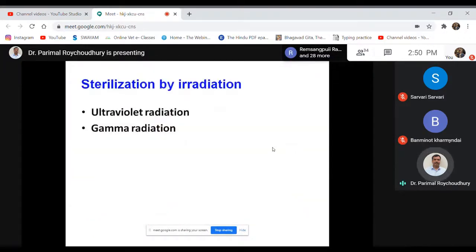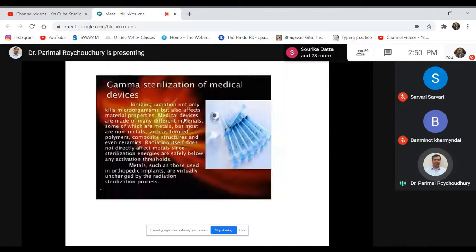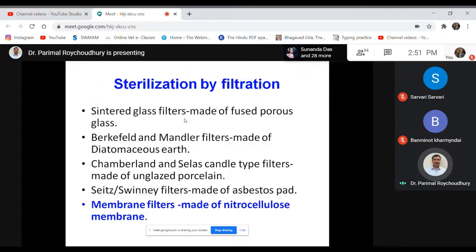Whereas ultraviolet and gamma radiation can destroy all surface components of biological material. Ultraviolet radiation mostly causes damage to the DNA of organisms, and the organisms subsequently get killed. So these are some of the physical methods of sterilization.